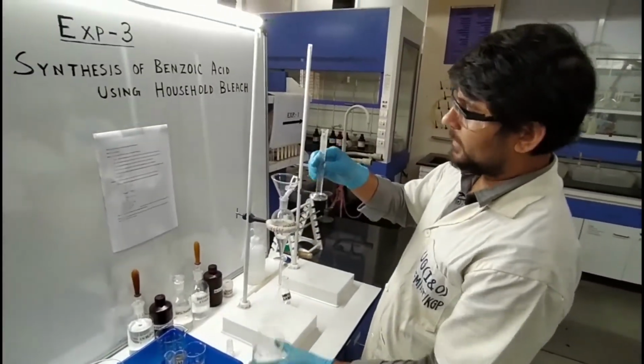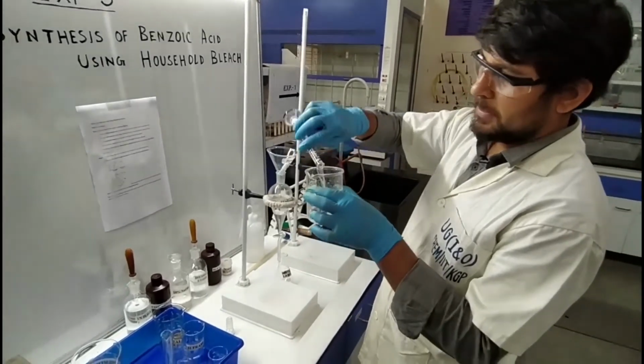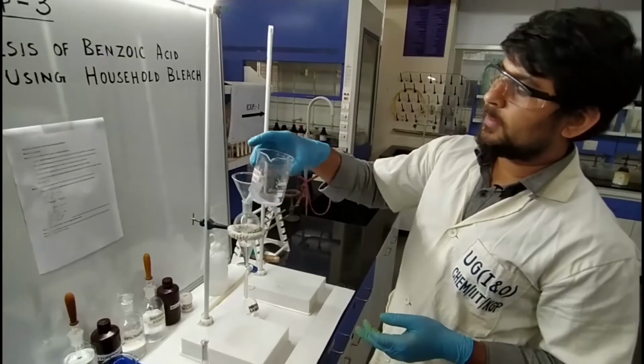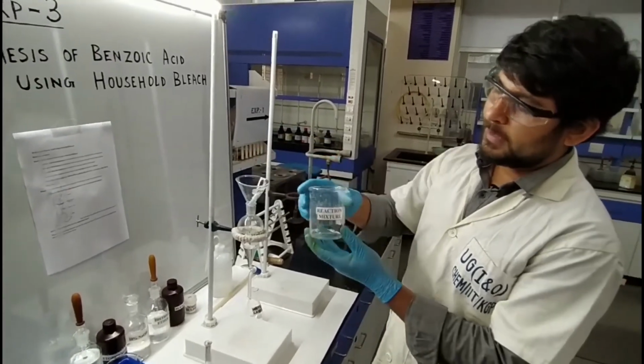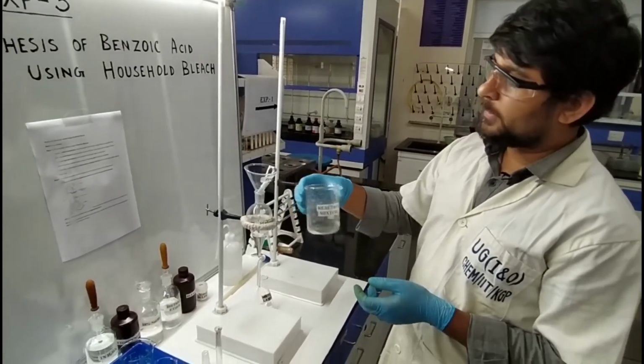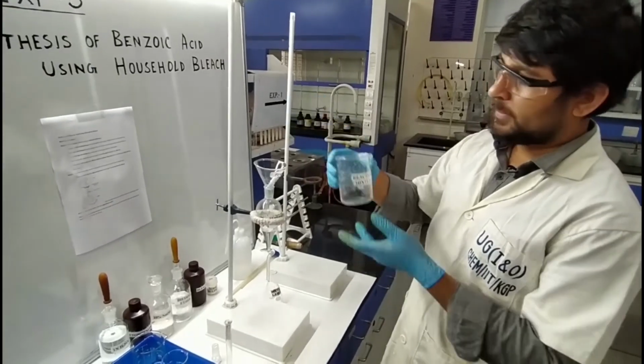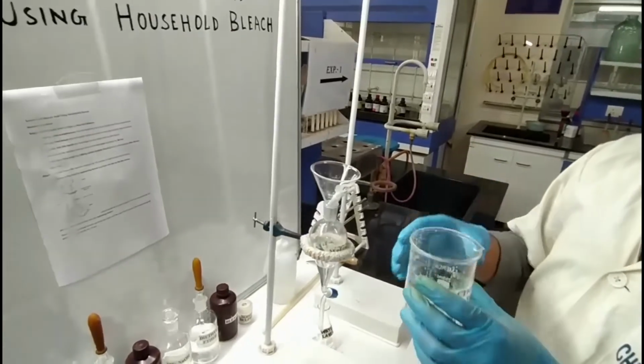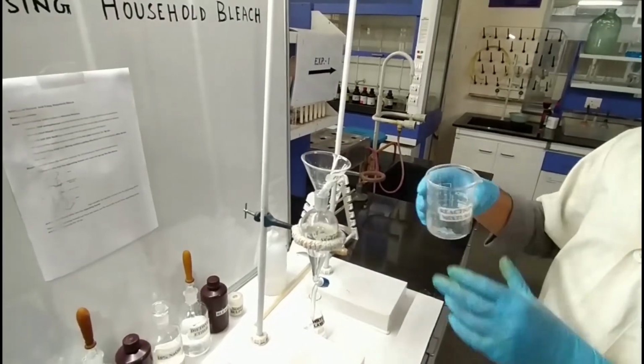This is the 10 ml diethyl ether. First I pour the diethyl ether into the reaction mixture, then I transfer this into the separating funnel. By this, all the residue in the reaction mixture is washed by the diethyl ether.